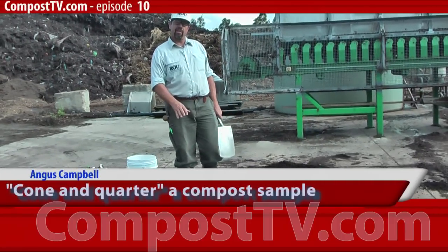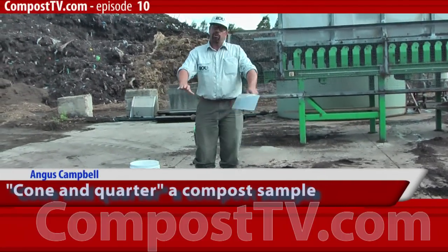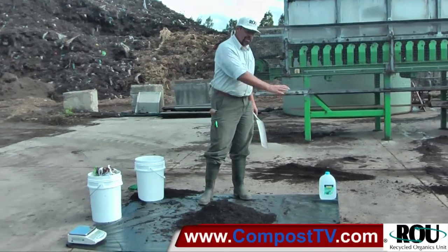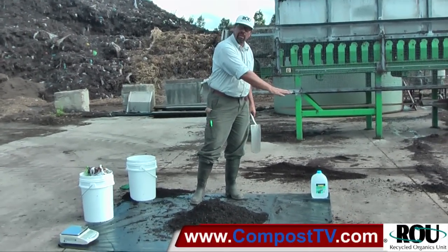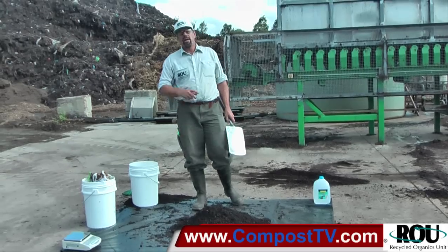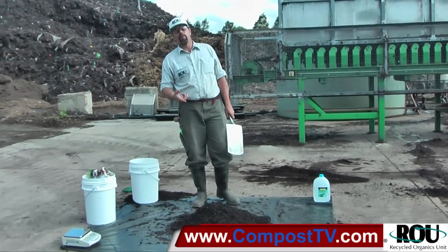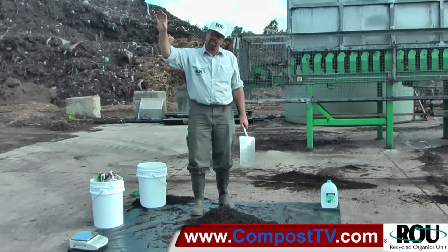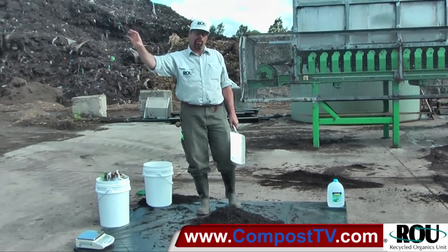Now that we've tipped our representative sample from our pile onto a sheet of the thickest builder's plastic you can find — that'll protect it from potential contaminants from the surface and keep a nice clean sample — we're going to apply the coning and quartering method to mix together the materials, all the increment samples we've taken from the sampling sites on that pile or windrow.